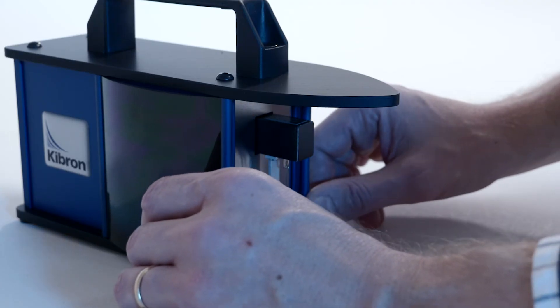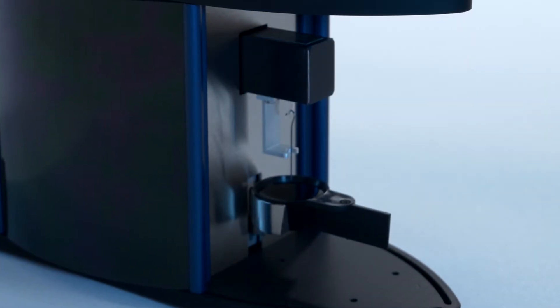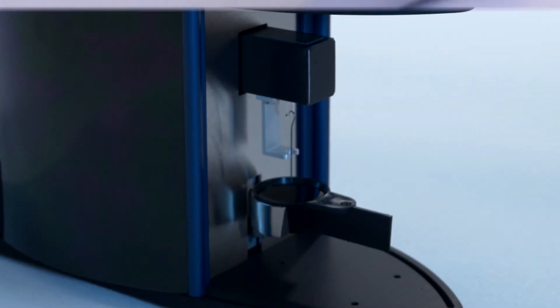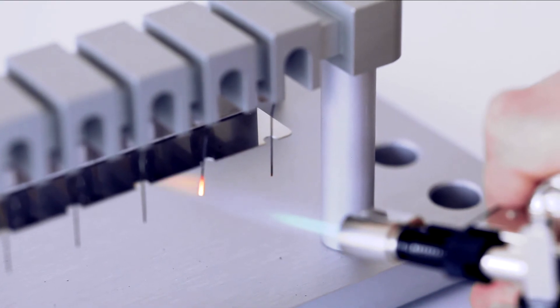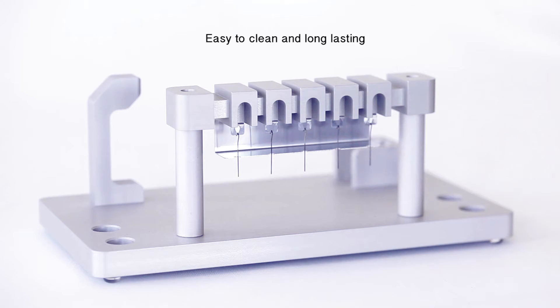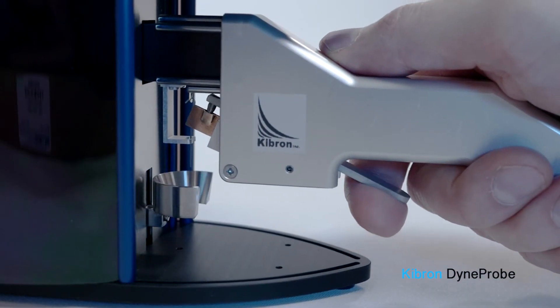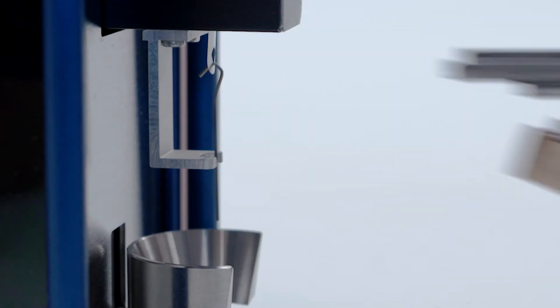Surface tension is measured with a custom-manufactured DIME probe with a consistent diameter of 0.5 mm and contact angle of 0 degrees to give repeatable, precise readings. DIME probes are easy to clean and long-lasting. The optional probe handler allows precise, correct positioning of the DIME probe every time.